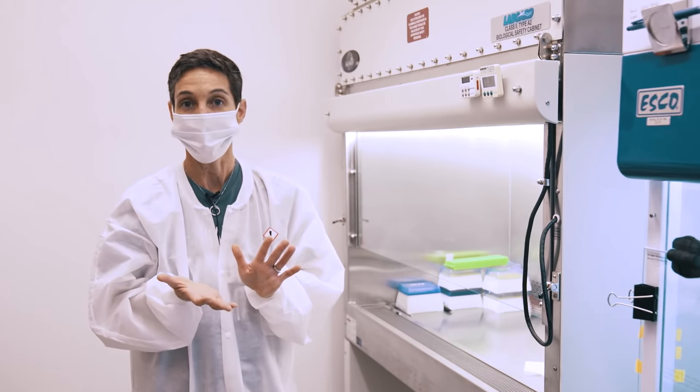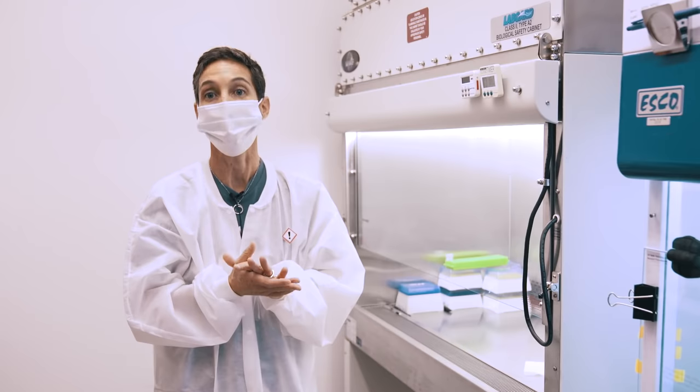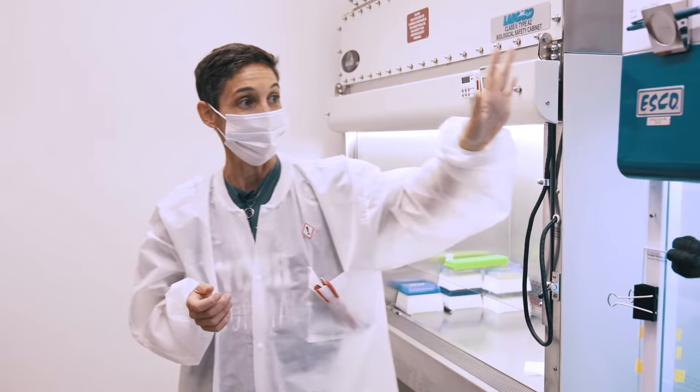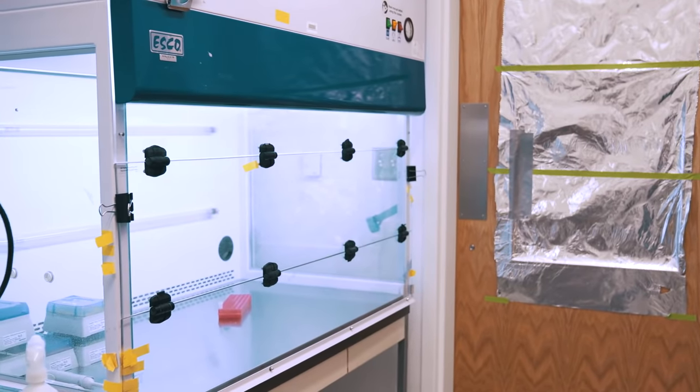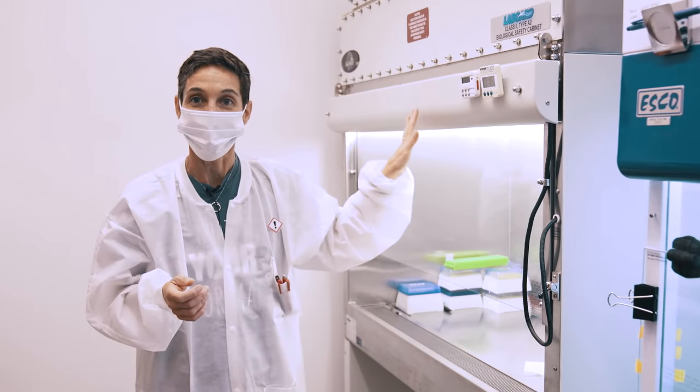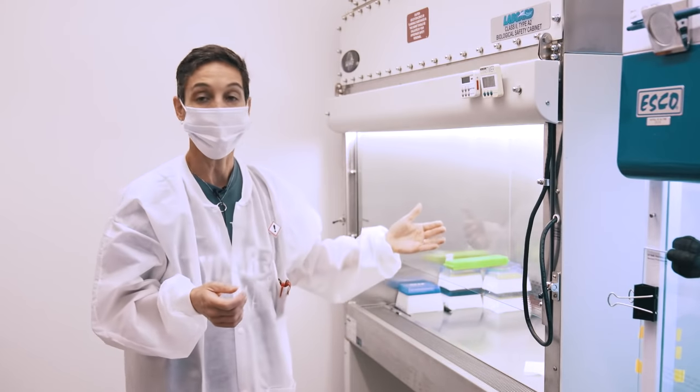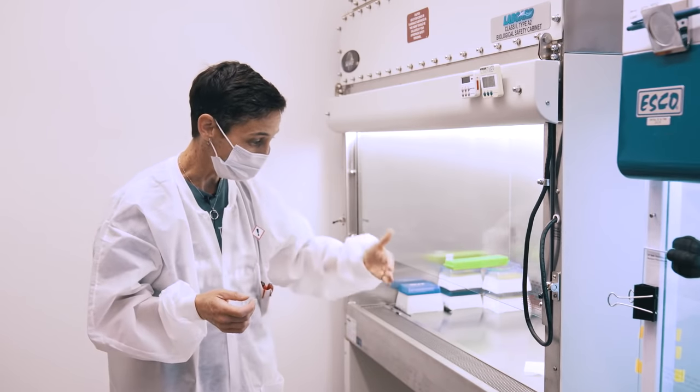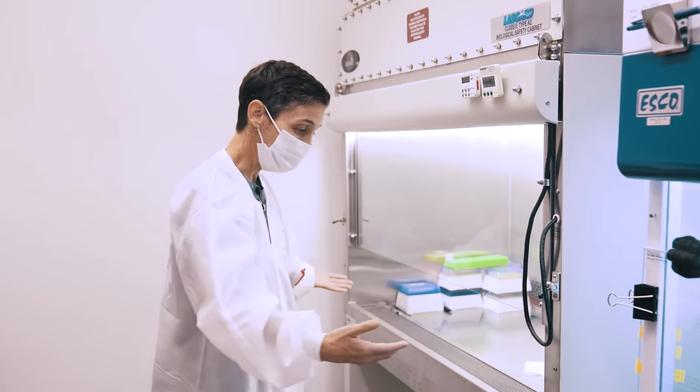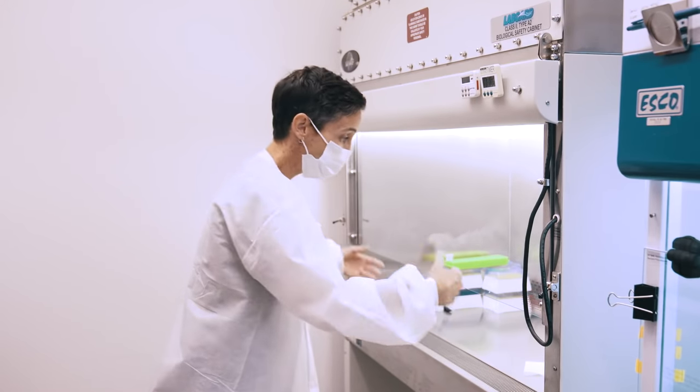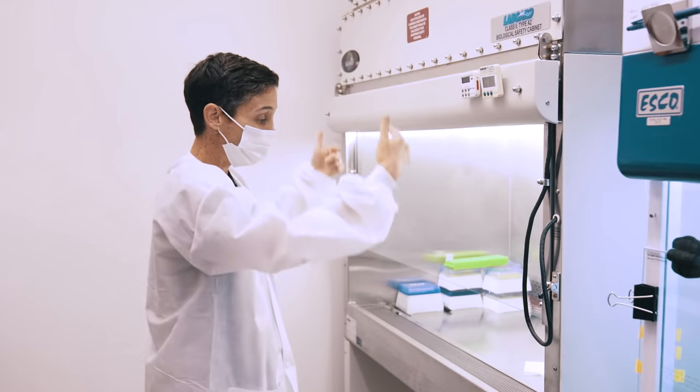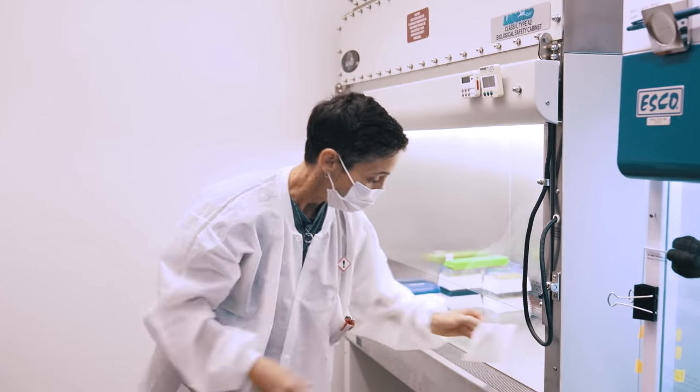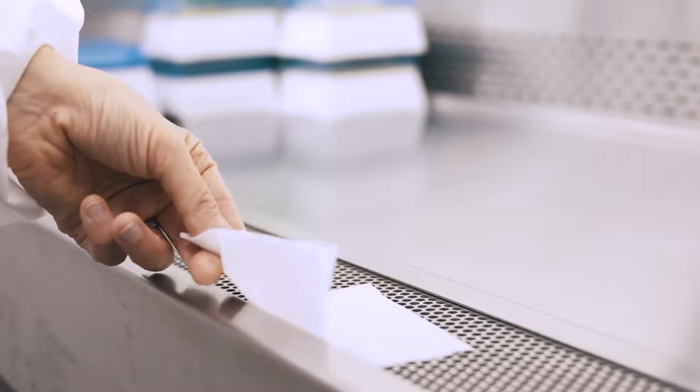First I wanted to introduce you to some of the equipment that we recommend you use. This is a biosafety cabinet and we also have in this room a clean hood. The biosafety cabinet is designed specifically to protect the user and the work from one another. The air circulates inside the biosafety cabinet pulling air in past the user that goes into this grate that is then circulated through a HEPA filter before it comes back down into the workspace. You can see how the air flow is pulled onto that grate.